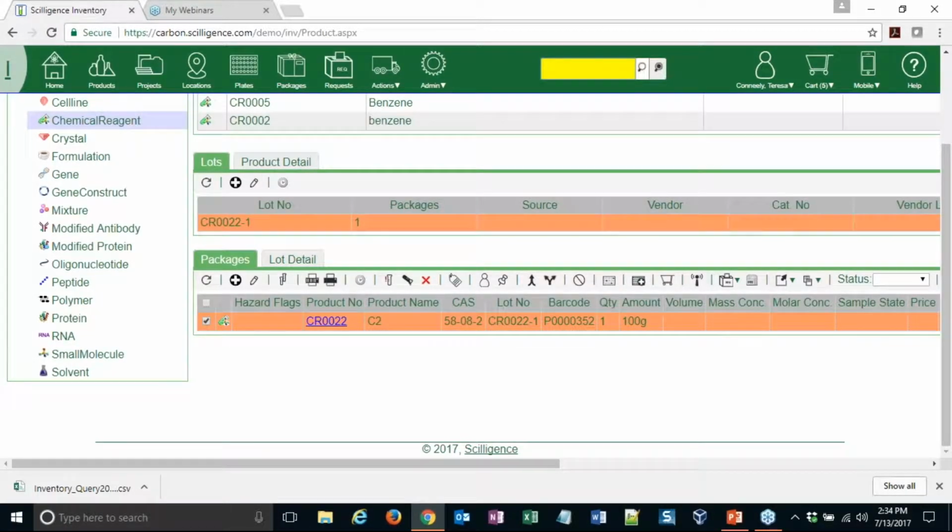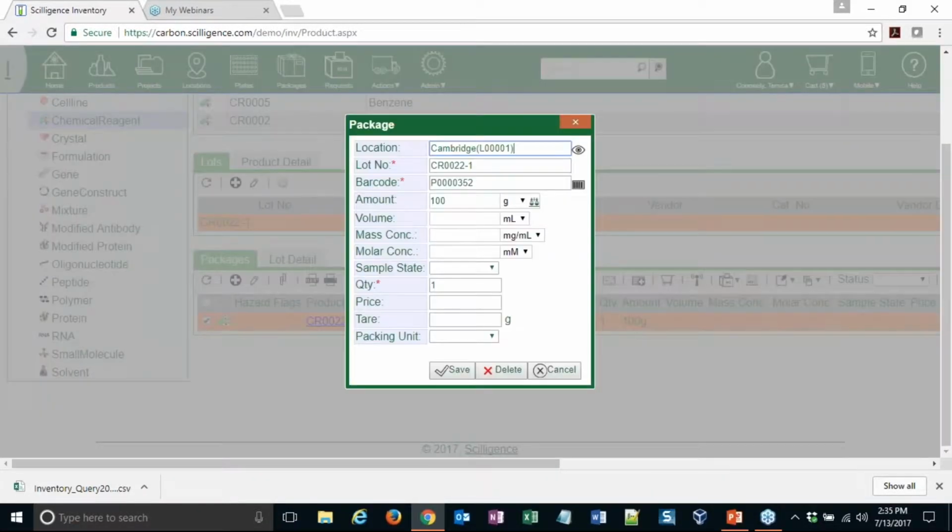For the scanner, you can use your mobile device to scan a barcode and enter the system. You can see that it's yellow here, you just scan a barcode in, it will turn green and automatically go into your system. And for the scales at the lot level, there's this button here, select weigh station. You can connect with your electronic scales and the amount can be automatically uploaded into this area.